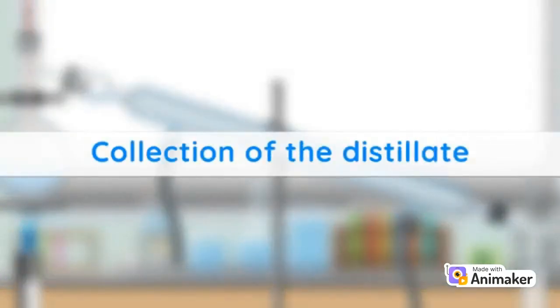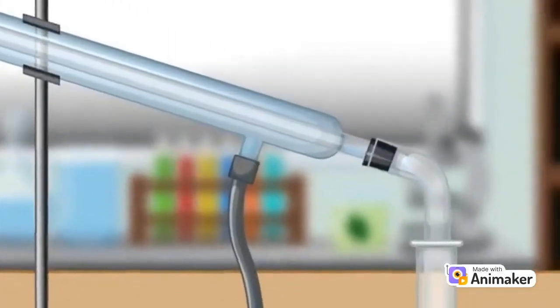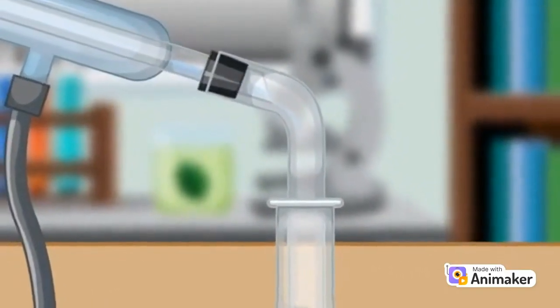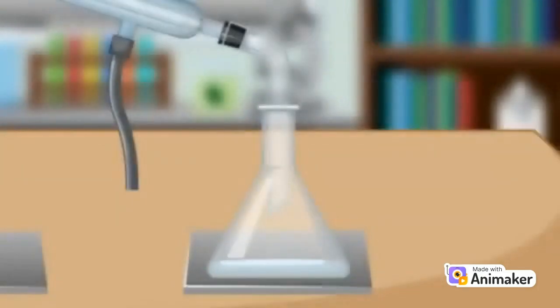Step 6. Collection of distillate into the receiving flask. Step 7. Completion of distillation.